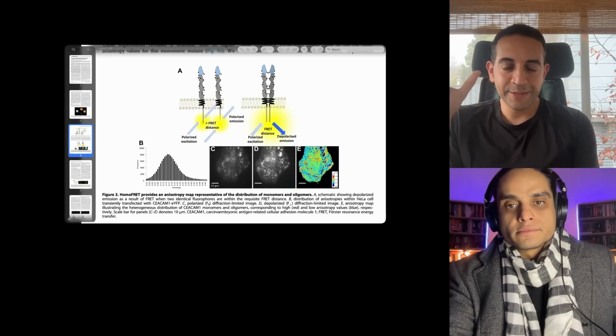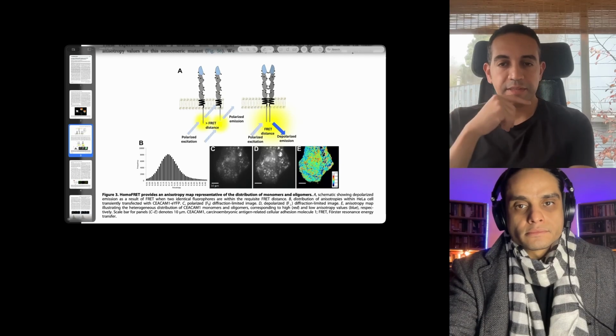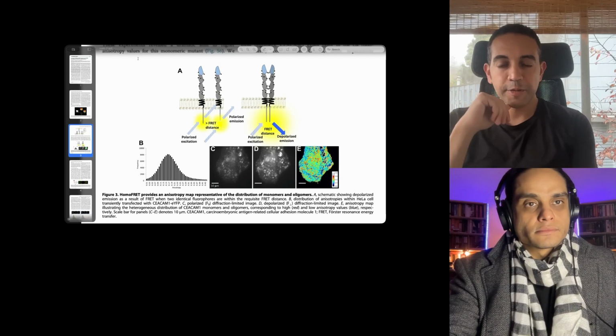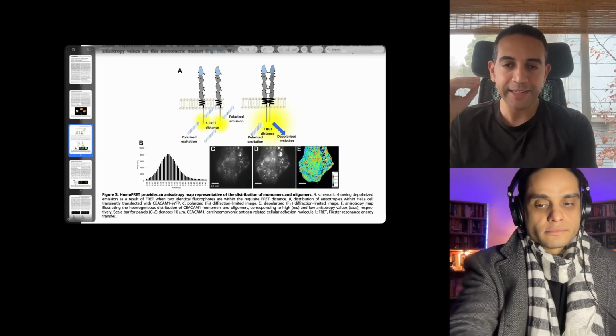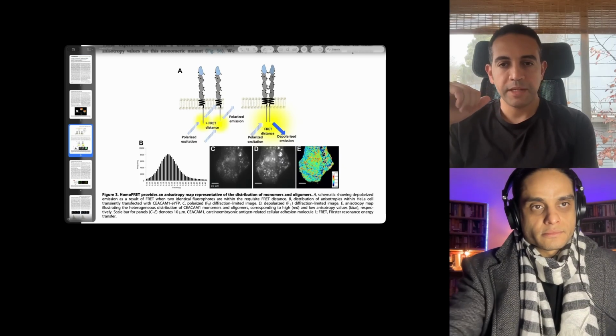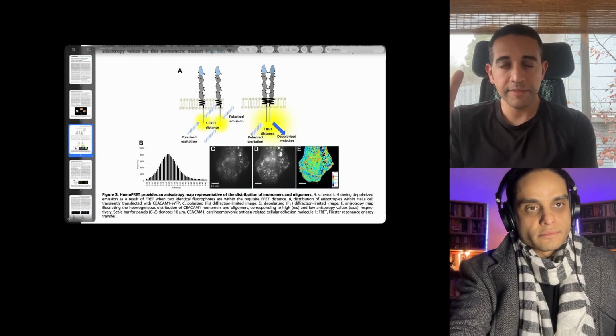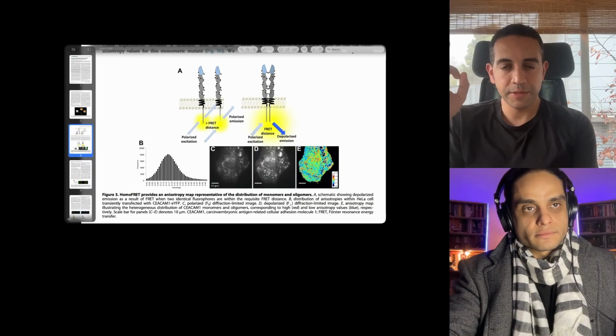And then the trick here, we're talking about the troubleshooting. You have two cameras that are receiving this emission. You can imagine that there will be a problem there. It's the camera alignment, so that you can calculate these ratios. And we had them in a position that's orthogonal. And you have this cube that is sitting in between the two cameras that is splitting the emission.